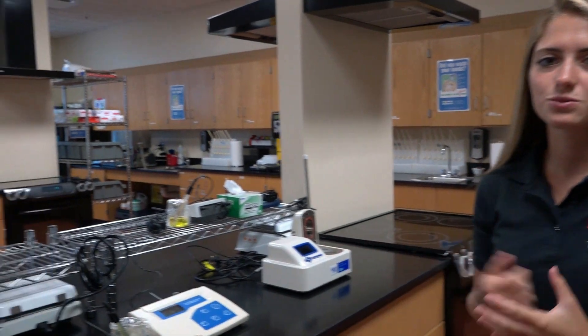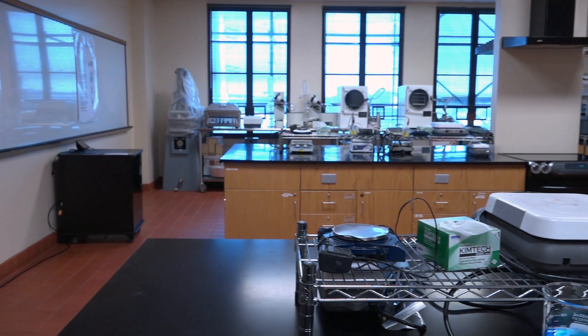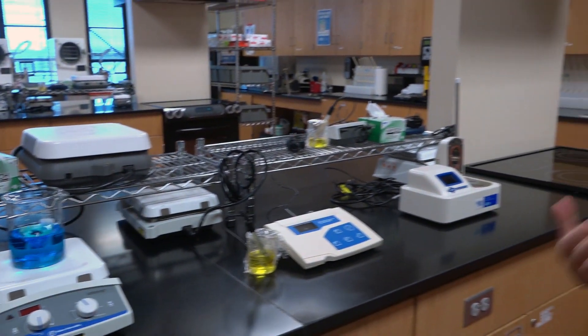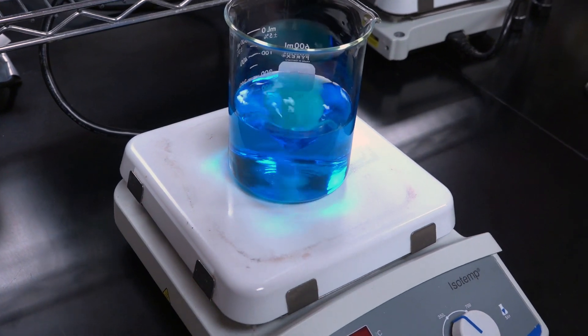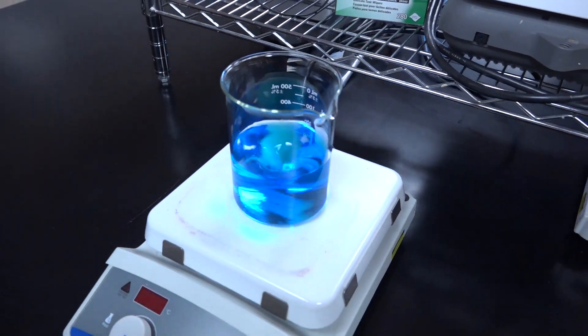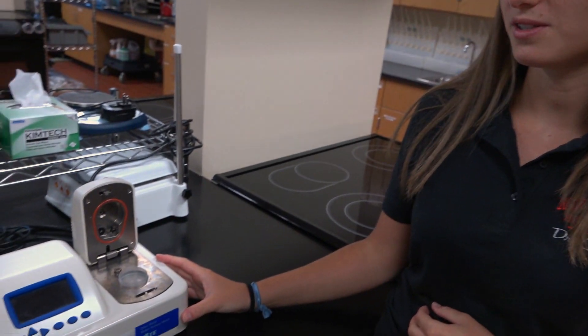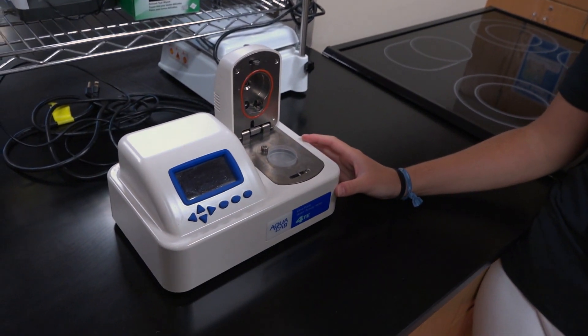This is where undergraduate students get their very first hands-on experience in food science — this is our experimental lab. This machine is both a hot plate and a stir plate, so we can raise the temperature, which is great for dissolving solids as well as mixing them. This is our water activity meter, which measures free water within a substance. So if you've had raisin bran and noticed the raisins are covered in sugar, water activity is the reason for that — they cover it in sugar to bind the free water so the cereal part doesn't get soggy.